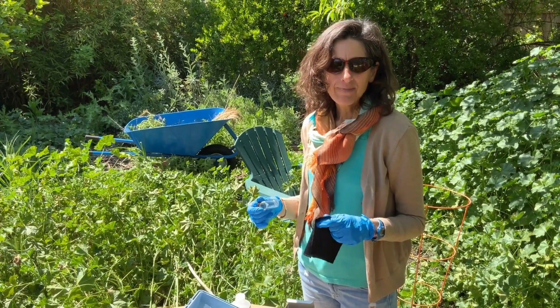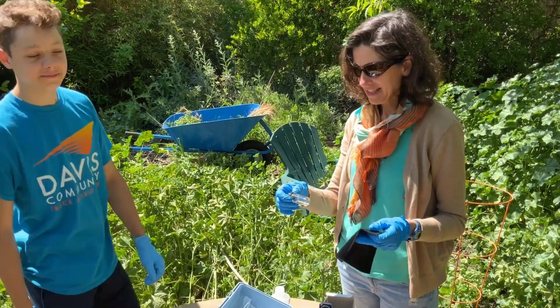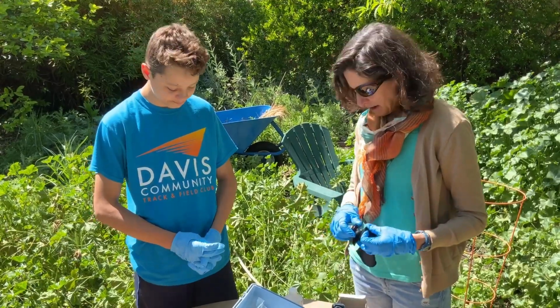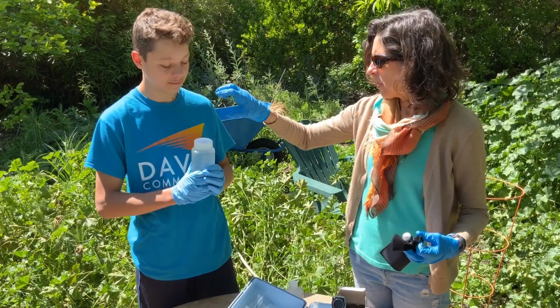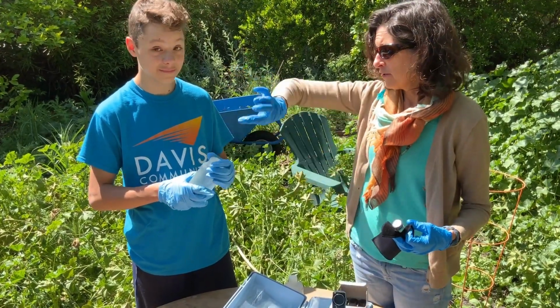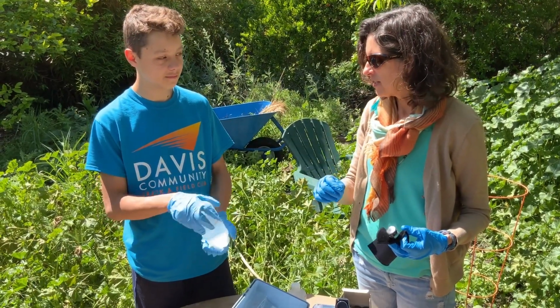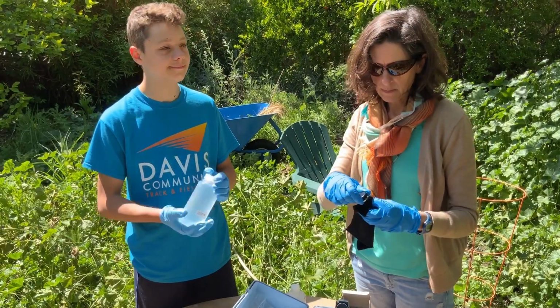So now we're ready to make a sample. I'm going to call up my assistant Eli, ready to make the sample. Thank you, Eli. And I'm going to have Eli do an important job, which is to gently invert it, just like that, 10 times, and try to not make too many bubbles. You don't want to make too many bubbles.